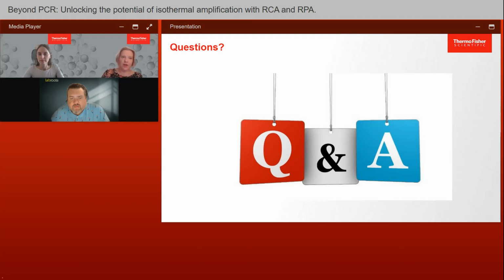If compared to other isothermal methods, such as LAMP, for example, in LAMP you need 6 primers, so it's much more difficult to design multiplex assays. So from isothermal methods, RPA is the method of choice for multiplexing. All right. Another one. Of course, oh, I can add. Raminta also commented about RCA, but it can be used for multiplexing.